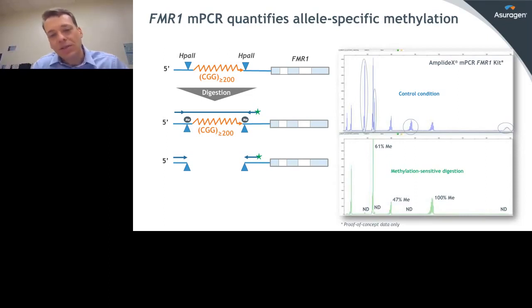And so what I'm showing here is actually the same profile for the composite of different FMR1 alleles that was shown a few slides ago, from 18 all the way out to greater than 200 full mutation, with the addition of a couple of controls that are incorporated within this reaction. But you start to see the benefit of being able to assess methylation when you split out the 2 color channels and then being able to do relative quantification of each of these peaks to assess the fraction that's methylated.